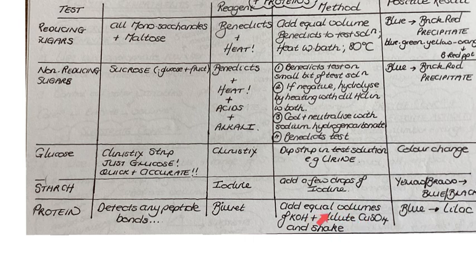So you add equal volumes of potassium hydroxide and dilute copper sulfate, and you give it a shake. Then you would add your test solution and give it a shake. And if the blue biuret turns lilac, then you know that peptide bonds and therefore proteins are present.